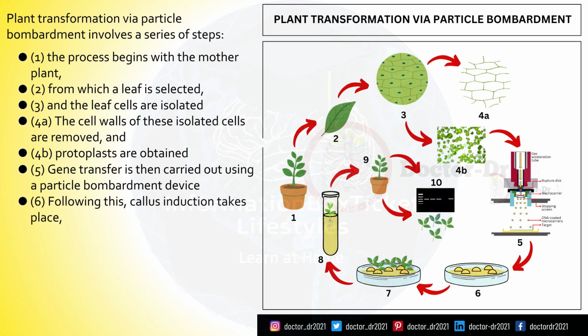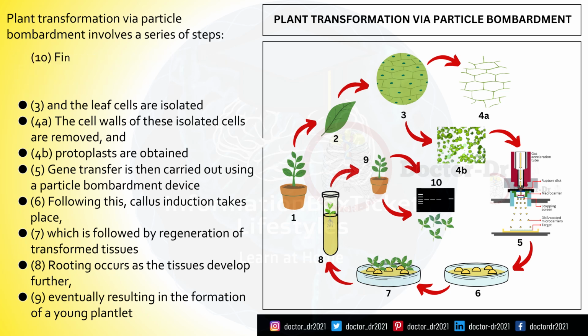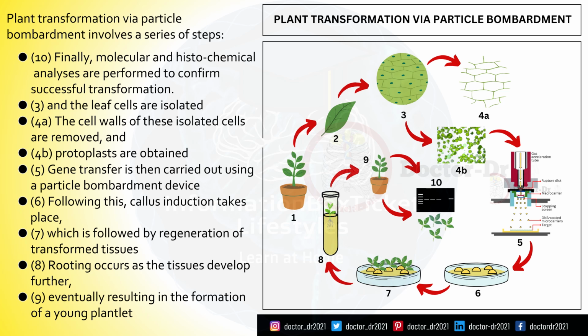6. Following this, callus induction takes place. 7. Which is followed by regeneration of transformed tissues. 8. Rooting occurs as the tissues develop further. 9. Eventually resulting in the formation of a young plantlet. 10. Finally, molecular and histochemical analyses are performed to confirm successful transformation.